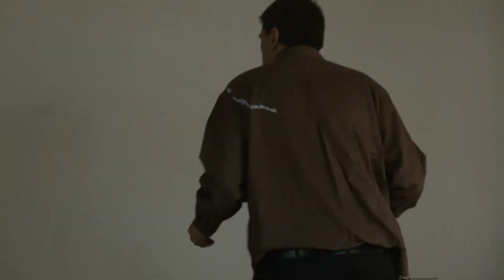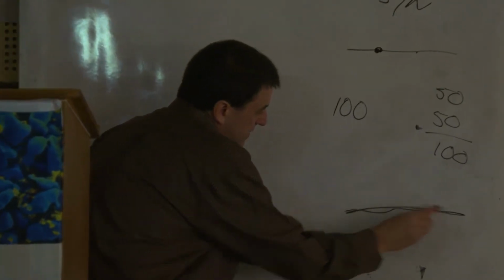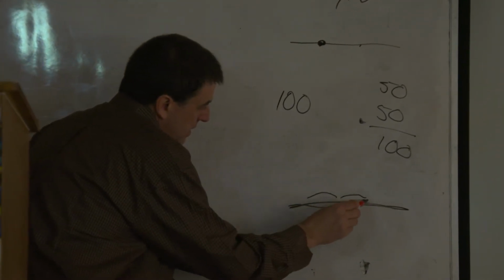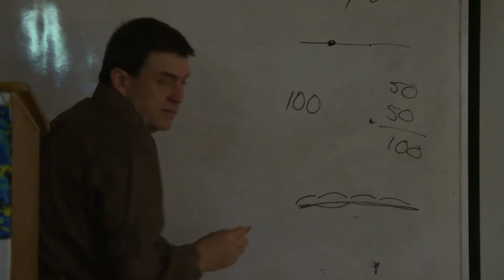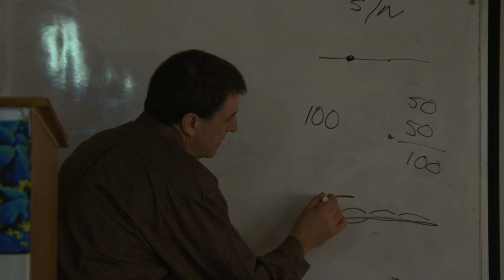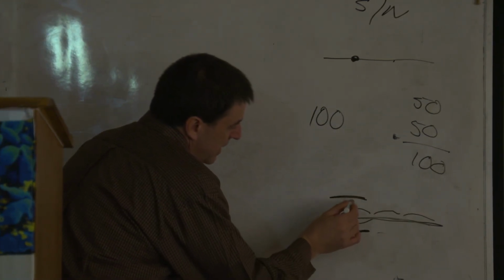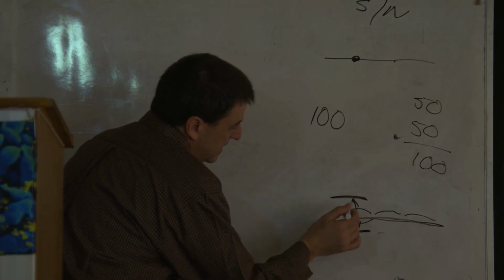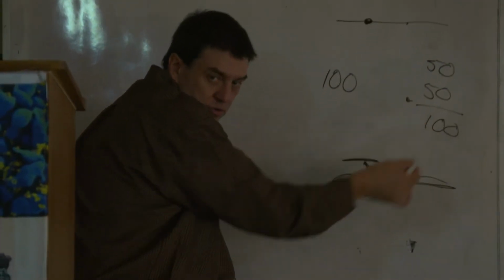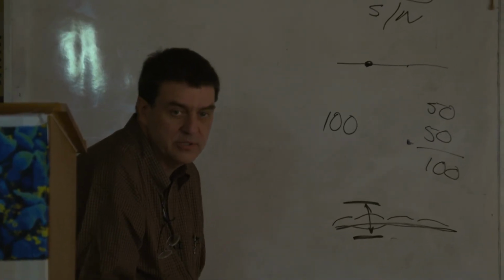Okay. But basically what you're going to do is this. When you're looking on a slide at cells, here's your slide, and these are your cells. They're only so thick. So you're going to start your stack here, and maybe stop it here, and then you would just continually go across it, and then you get the top of your cells and the bottom of your cells. So you get your whole cell each time. That's usually how we go about it.